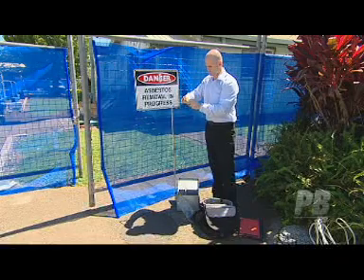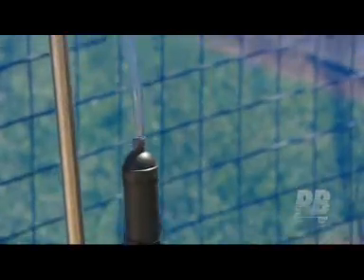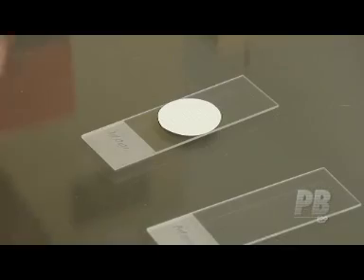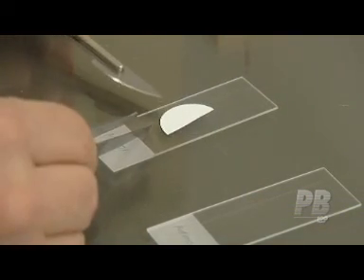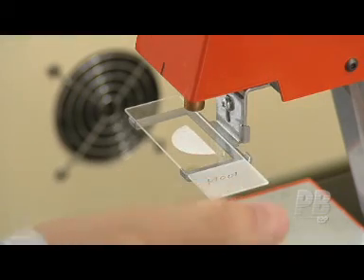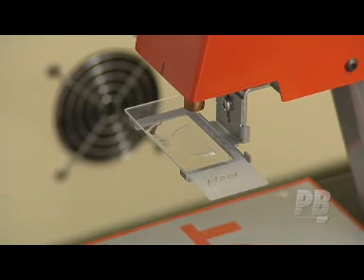Asbestos air sampling is undertaken by drawing a sample of air through a filter by a calibrated pump. The filter is analysed under a microscope by counting fibres according to a geometric criteria. It should be noted that this method errs on the side of caution, as it counts all fibres irrespective of whether they are asbestos or not.